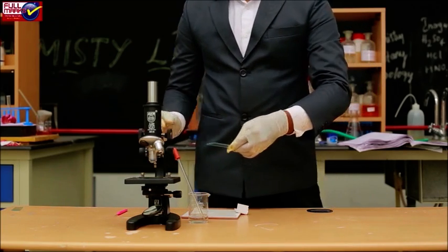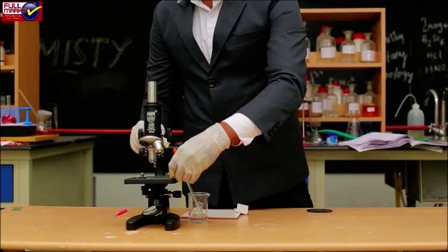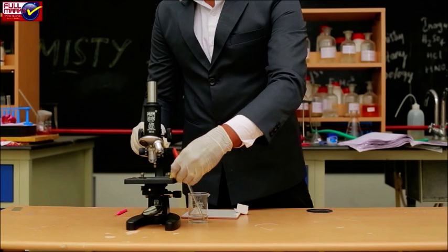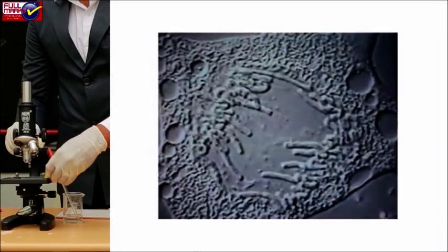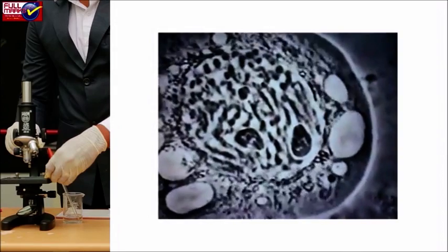Observe the slide under the microscope for different meiotic stages. Observation: Observe various stages of meiosis and identify them.